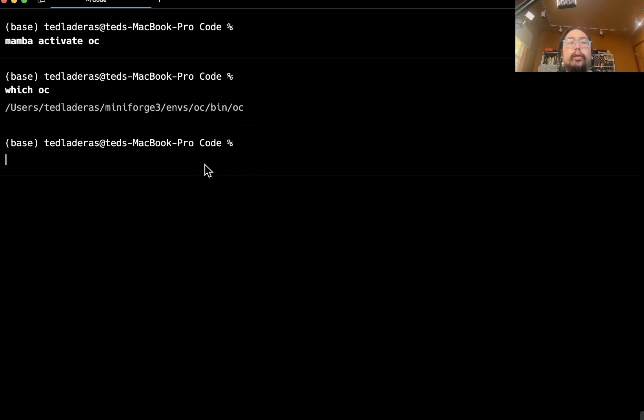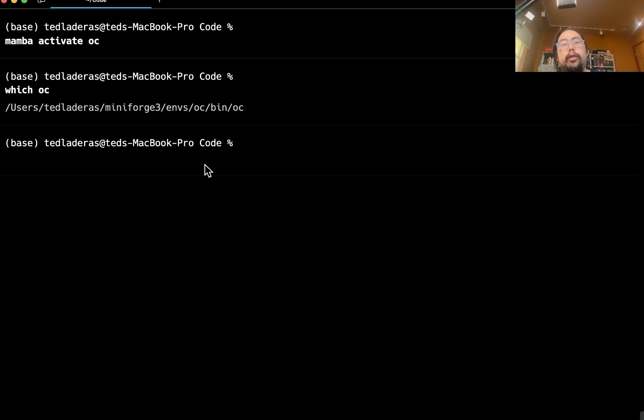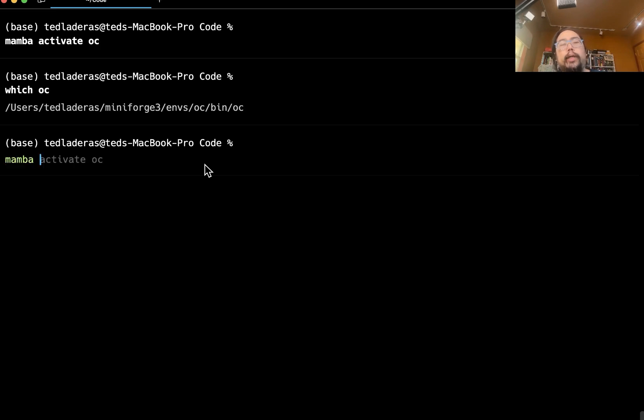So again, best practices with conda environments is that you do your work, you activate OC, you do your annotation. And then when you're done, you deactivate that environment. So when you're done, do a mamba deactivate.